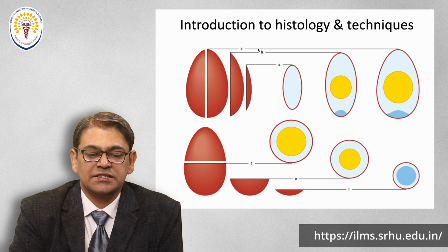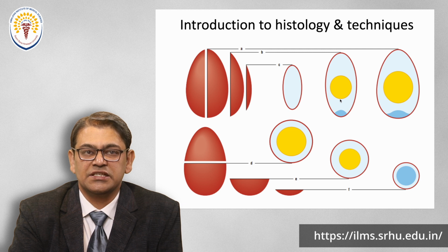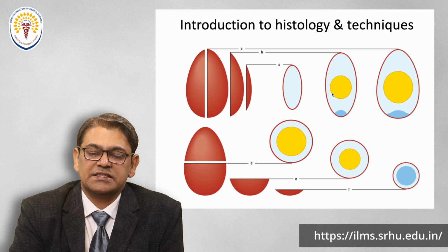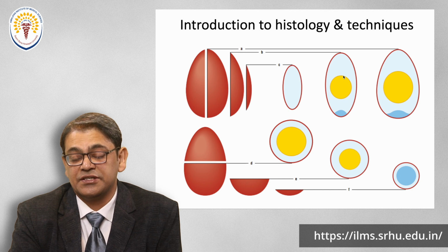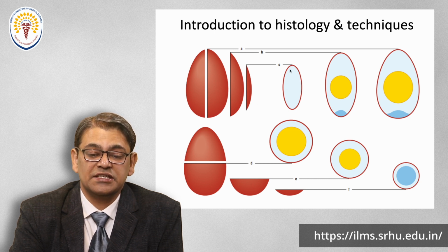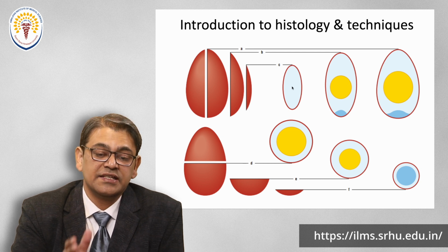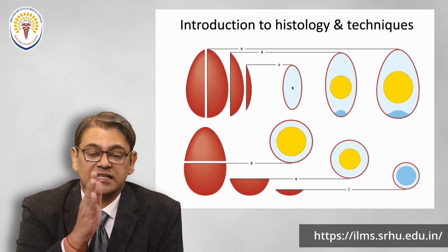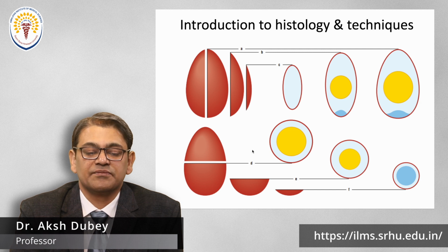But if you see this B1 and you move slightly lateral, where the section passes through the slide laterally, you see a significant change in the presentation. Here the area is reduced, and the diameter of the center is also reduced. Now if you see this C1 and you go almost laterally, close to the lateralmost area, we see only a periphery, and the central yellow core region is almost out of it. This is one section, or the vertical section, which in anatomy is named the coronal section, and it is passing through that.